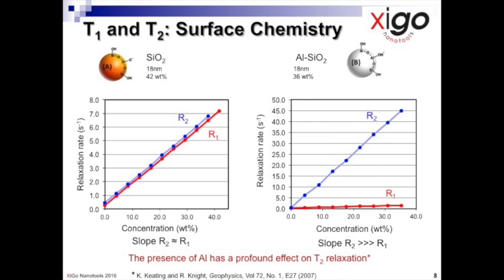The magnitude of the NMR signal depends very much on the specific material under test. Here we compare two samples of monodispersed colloidal silica dispersions. One is a pure silicon dioxide, the other is an aluminum modified silica. Both dispersions had been extensively dialyzed against distilled deionized water.